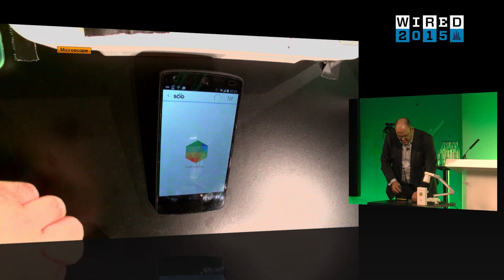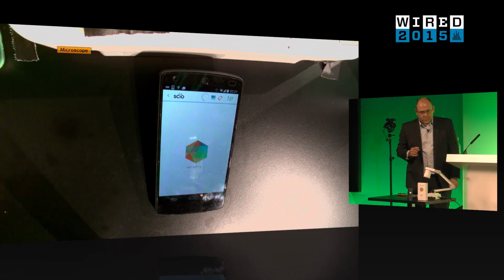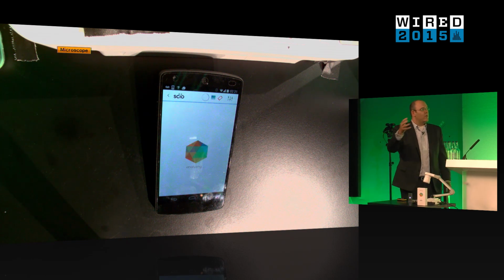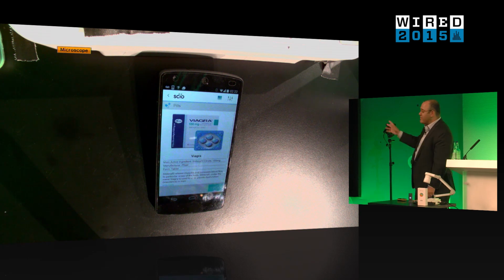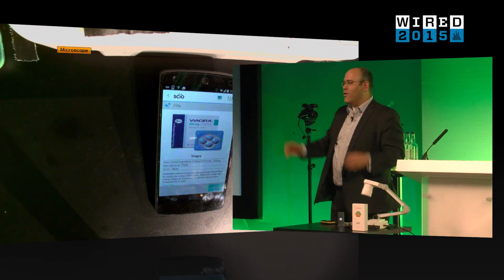and drop the pill in there, press scan, and we're almost out of time, but I hope you can see it. What is happening now in real time is actually creating the fingerprint, sending it to our cloud for analysis, and the result will be sent to the phone in real time. There you go. It actually says it's Viagra. I'm out of time, but thank you very, very much for your attention.